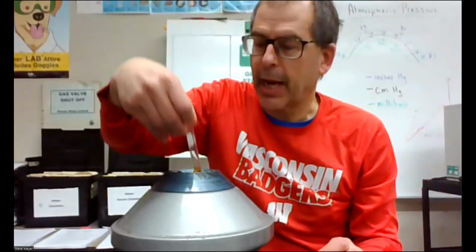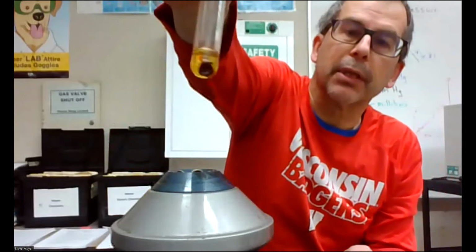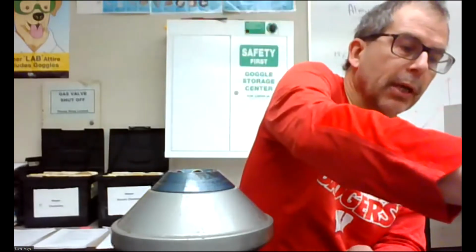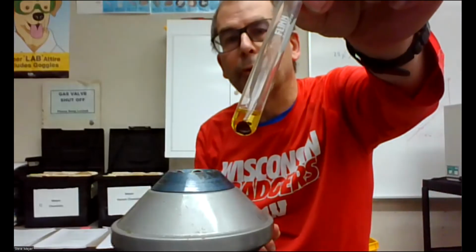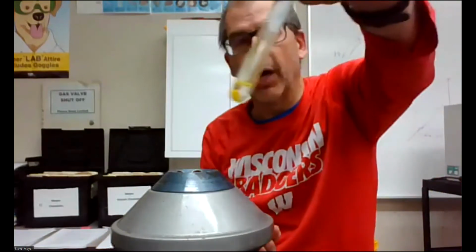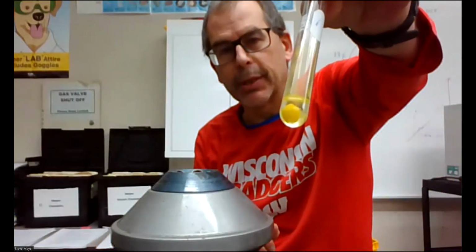And then the other reaction still has a yellow solution, but there's that maroon precipitate. So it gives you a visual of what's going on. The first precipitate was white, the second one, for B, was the maroon, and the third one is the yellow precipitate in the clear solution for experiment C.